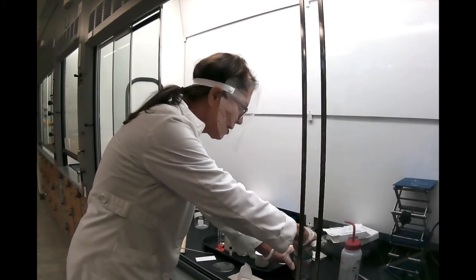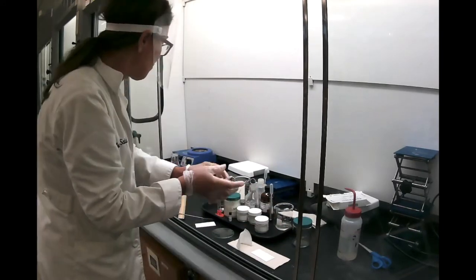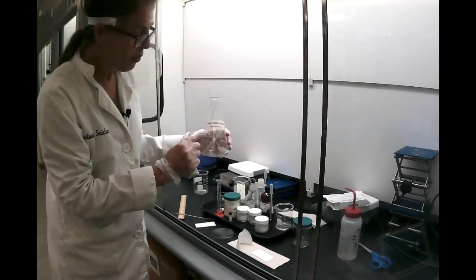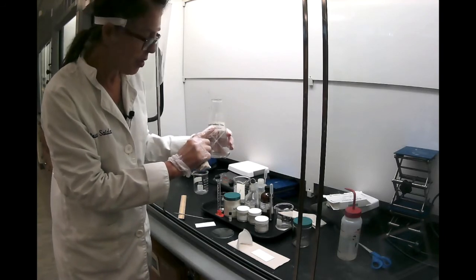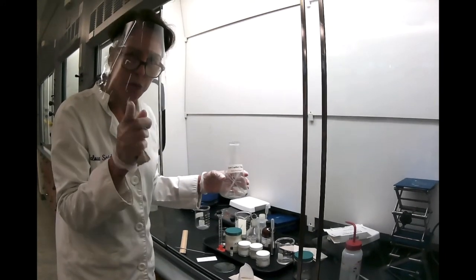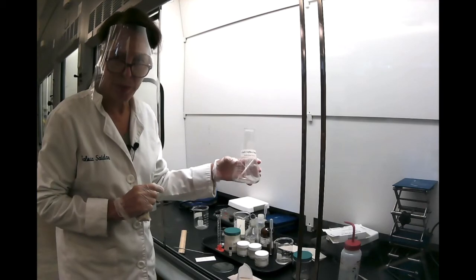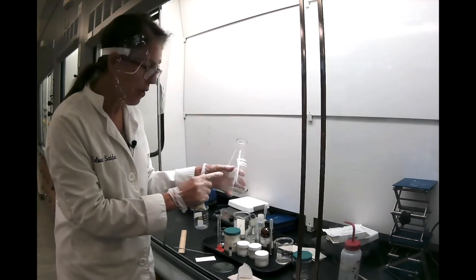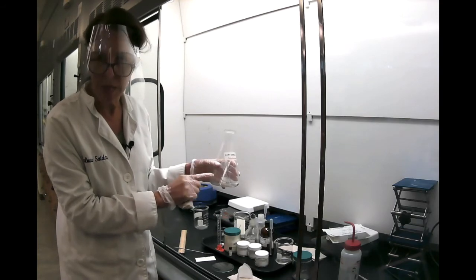And while we wait, I want to show you one more thing, which is that for the used capillary, we have a container here that says used capillary tubes, and it will be in the fume hood, but for the purpose of the video, I'm showing it right here. All your capillaries that you used should go in this container.